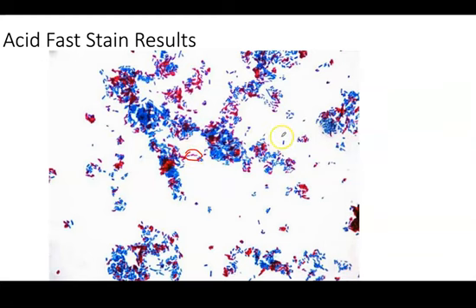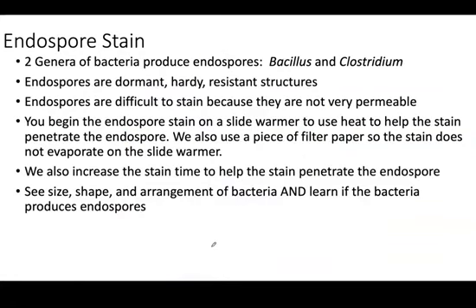But then you have clusters of blue. So here's a blue, and then here's some blue and fuchsia intermingled. But you could then point to any bacteria and say, oh, that bacteria would be non-acid fast because it's blue, whereas this bacteria would be acid fast because it's fuchsia, or that magenta color. So that's our second differential stain.